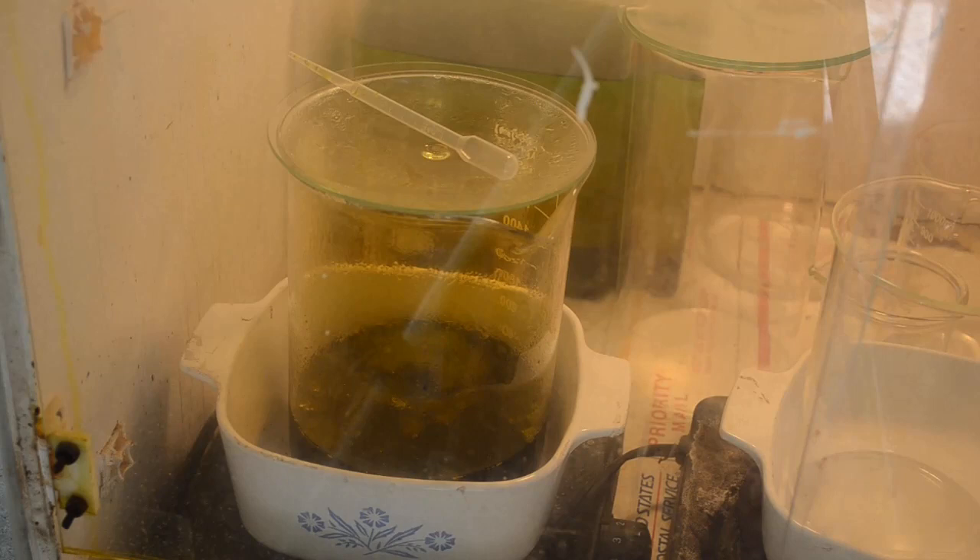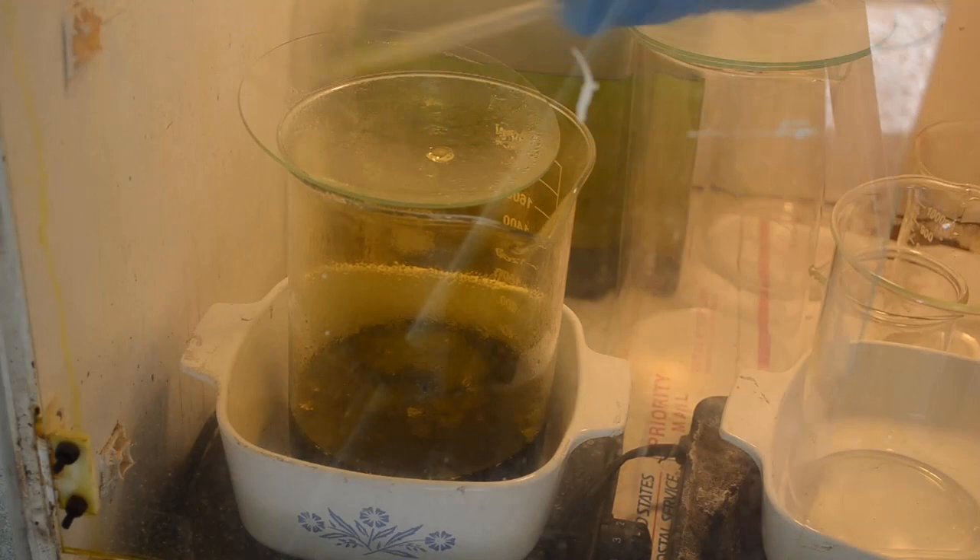I wish I'd filmed it, but when I was done with that cell I filtered the liquid so I could reuse the copper nitrate electrolyte, and there was a lot of crud in the bottom of that beaker — more than I would have expected. Just on a lark I took the filter with all that crud and dissolved it in a beaker of aqua regia just to see what I'd get, if anything. I wasn't expecting much. Let me show you something — let me get a little of this liquid.